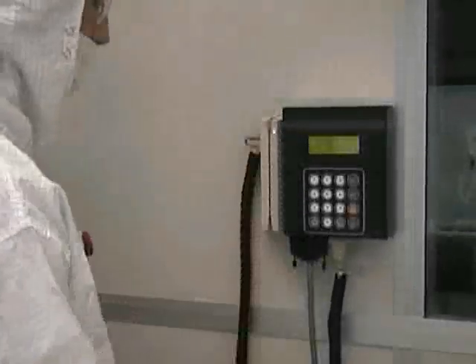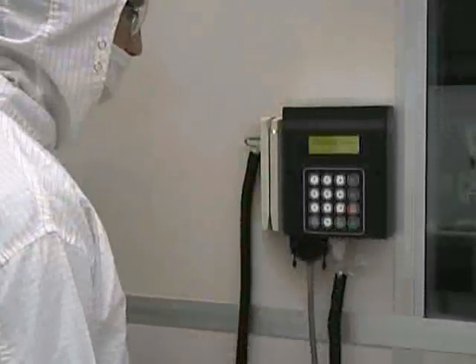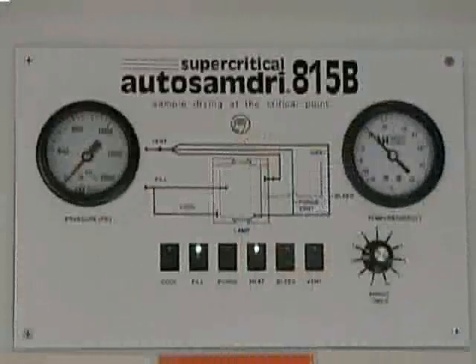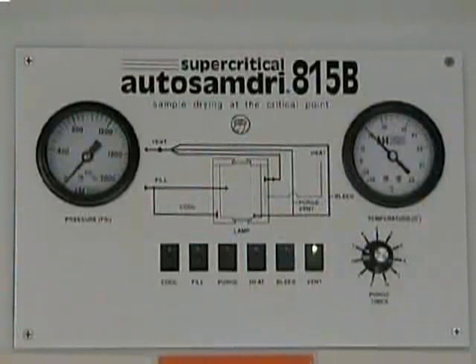To begin using the supercritical dryer, you must first swipe your buzz card at the AXIS controller, then select the supercritical dryer from the list of available machines. The green LED light on the vent button should then illuminate, indicating that the power is on and that the unit is on standby for the vent mode.